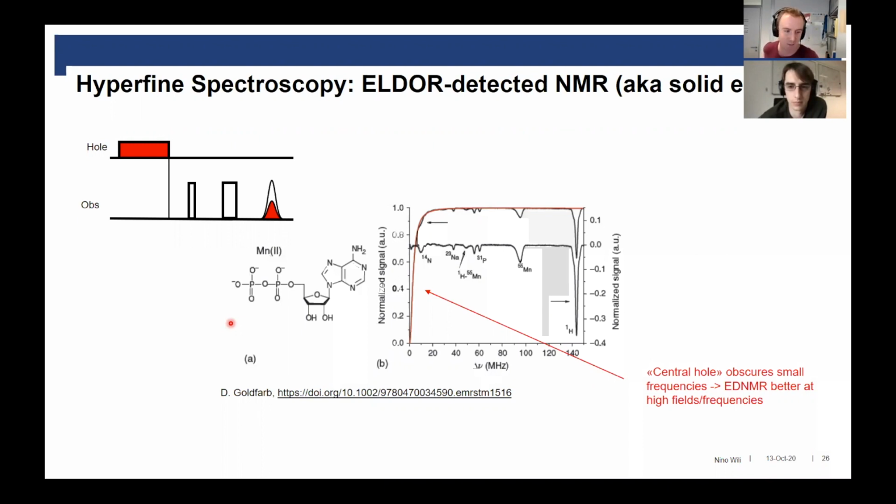But you can do it at different points of your spectrum, and this is where orientation selection might actually come into play. Depending on where you do it, you might get different couplings, because for different orientations the couplings might be different. Does that make sense? I guess usually you start at the maximum to get something. Great, thank you.